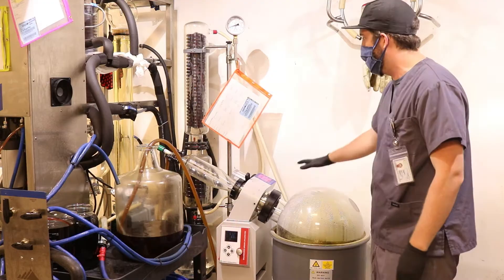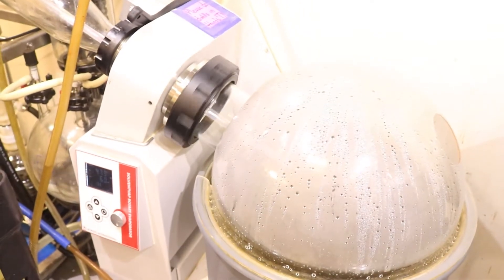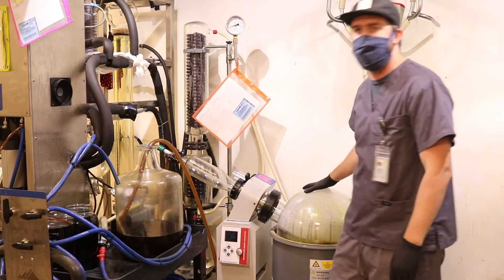We will then pump the extract into a rotovac, where we will use a heated water bath and vacuum to evaporate the ethanol. We will recondense on these columns and drop out and concentrate the oil.